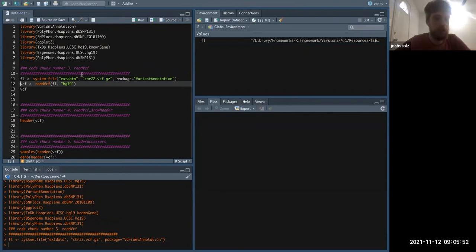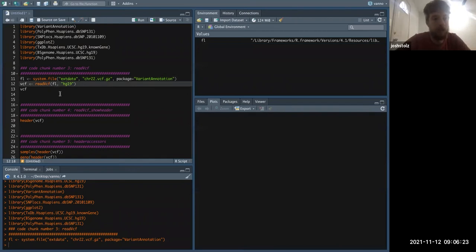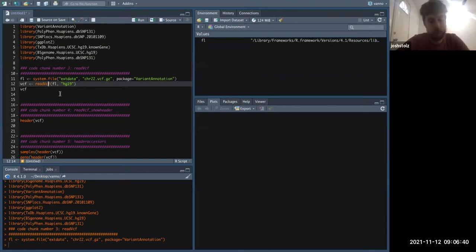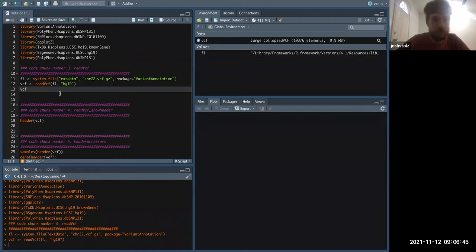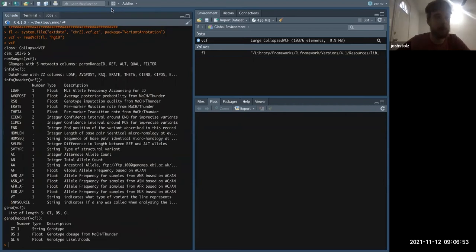Within our library data, we have this VCF we're calling FL for now. In normal usage, if we were reading in the Weber data, it would be like RBCF.gz here. But you can use R objects that are in VCF format. We're going to use the readVCF function, which takes a variant call format file and turns it into an R data object. It's almost like a RangedSummarizedExperiment object in a way.